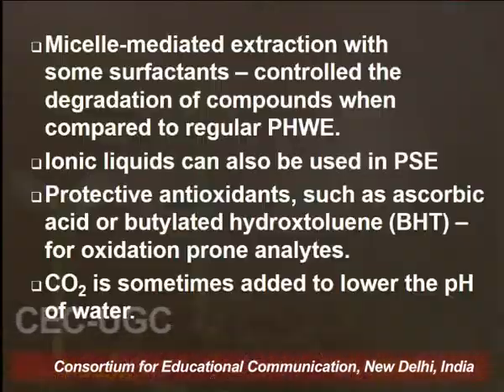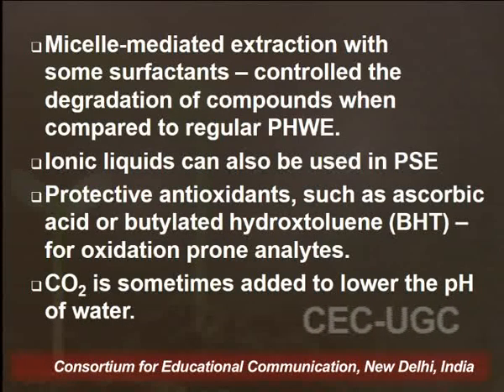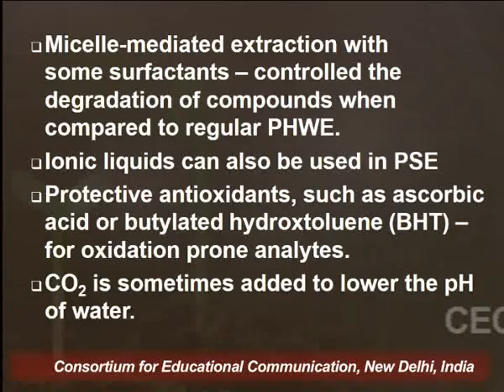Now during extraction there are certain constituents which are vulnerable towards oxidative damage or oxidation, by which they are degraded. For such constituents, certain antioxidant compounds are also added, like ascorbic acid or butylated hydroxytoluene, also known as BHT, and these antioxidant compounds prevent the oxidative degradation of those solute molecules.